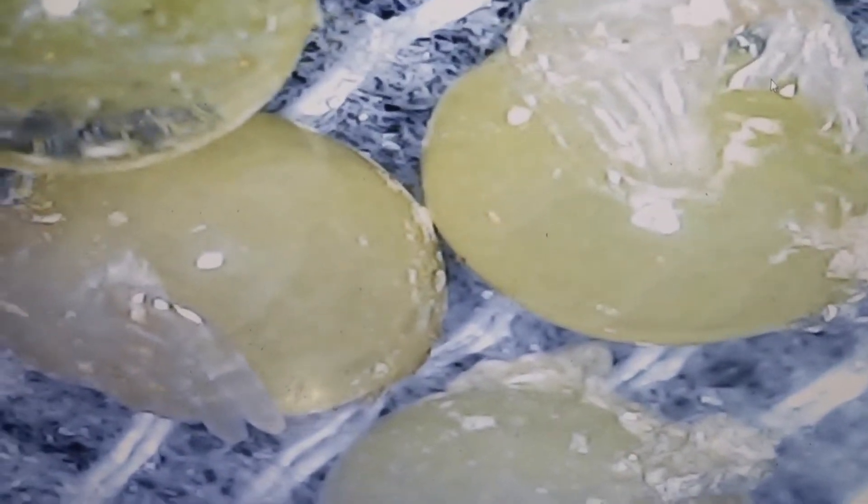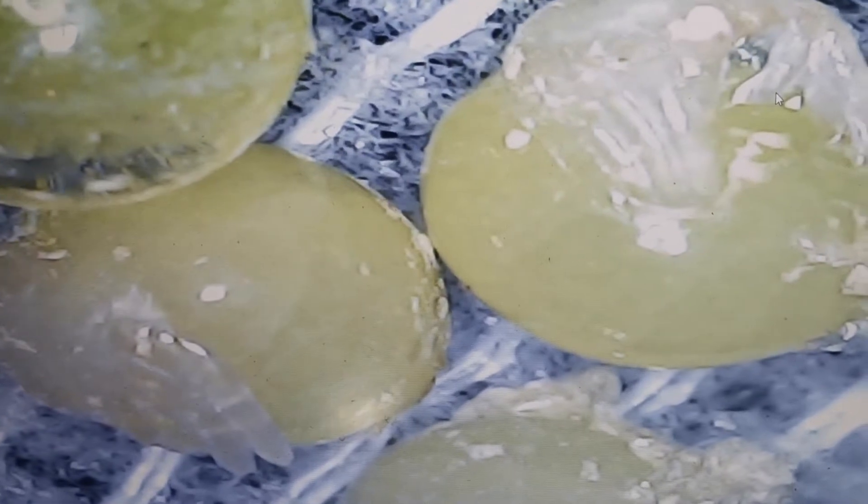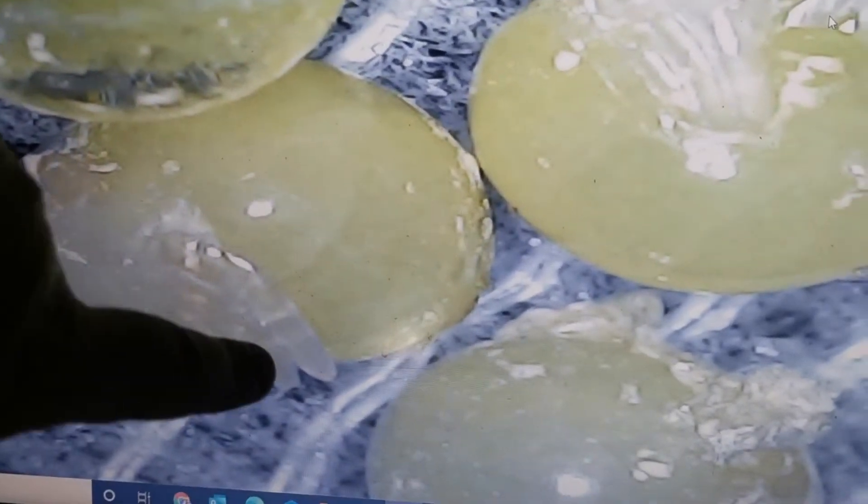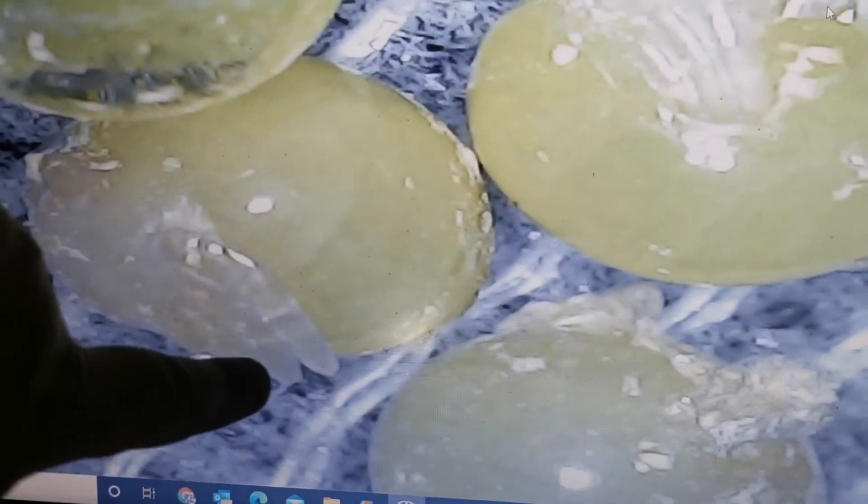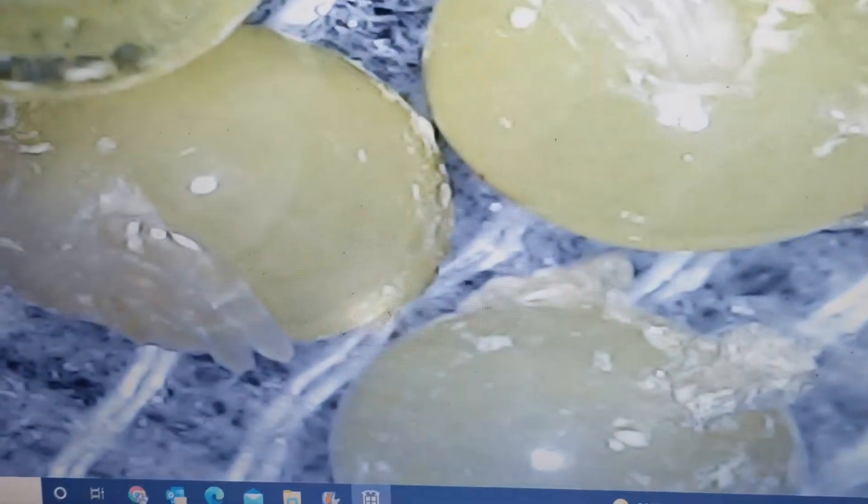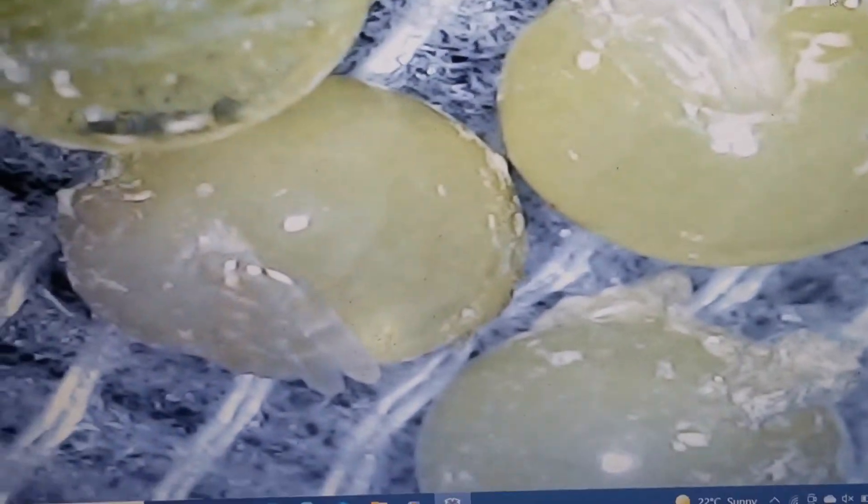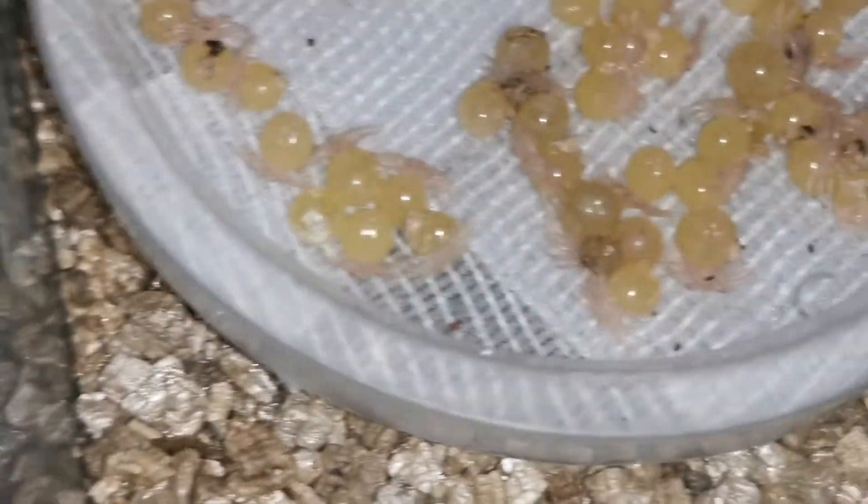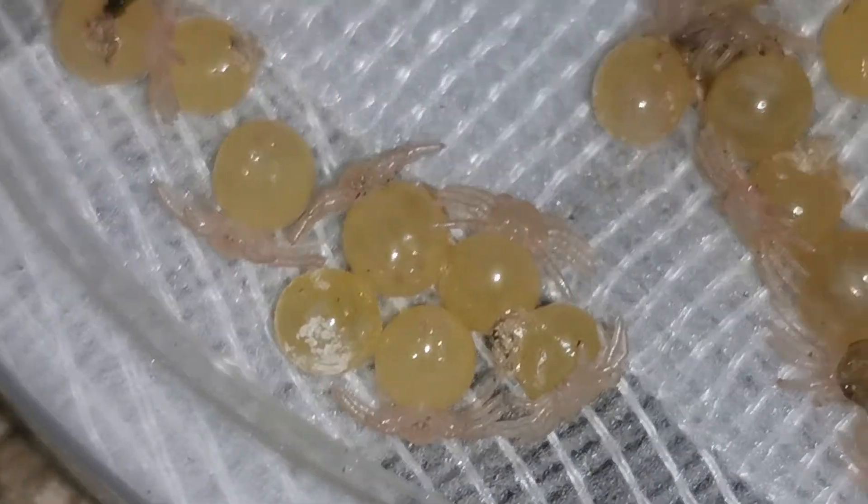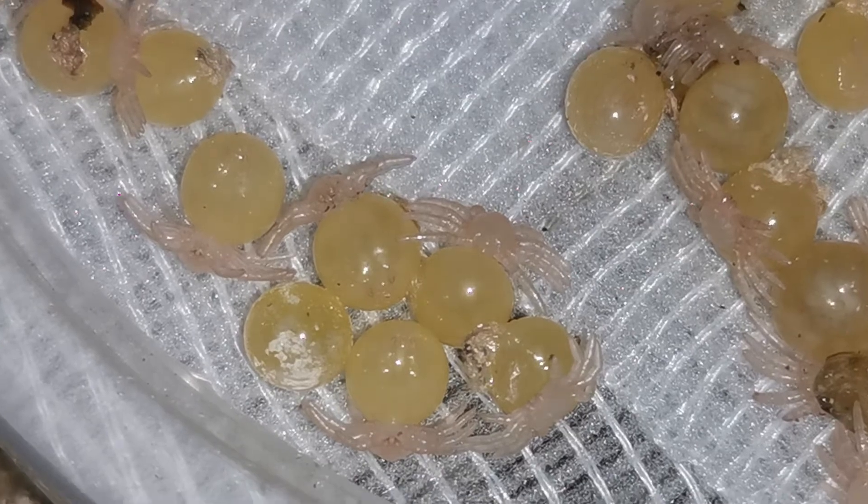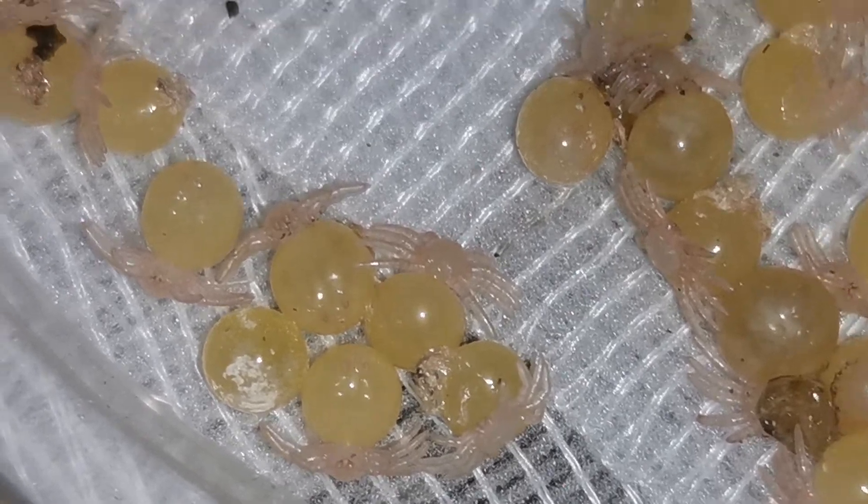So now what you can see on the screen there is little eggs still developing. They will now shed out of their skin and become spiders. Here you can see there's actually legs starting to form. That's the head coming, then that's the piece of the shed that's coming off. So those are the heads, and then when they are done, they will look like these ones with the little feet and everything on.